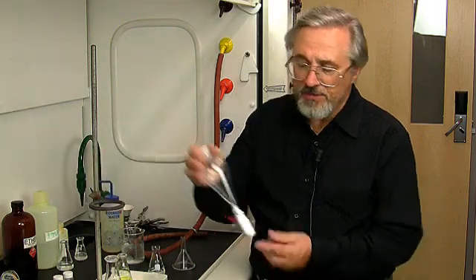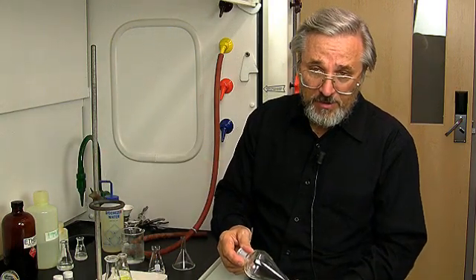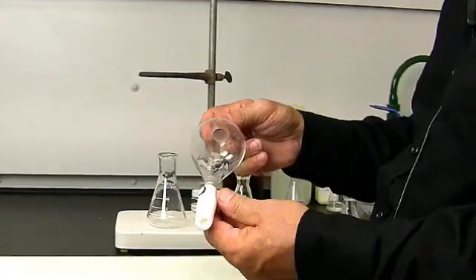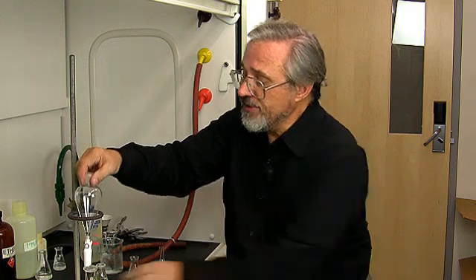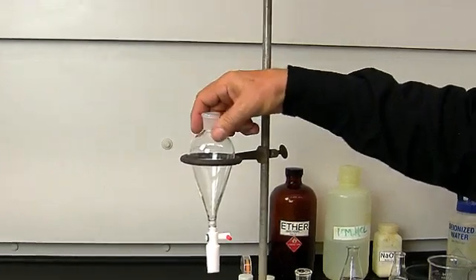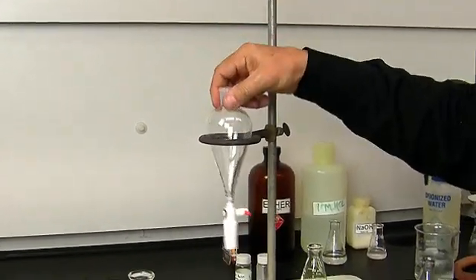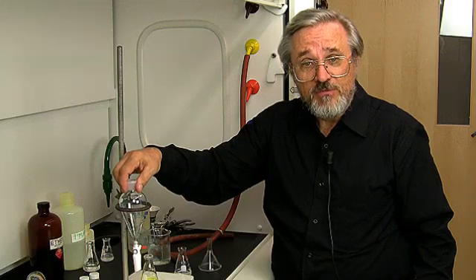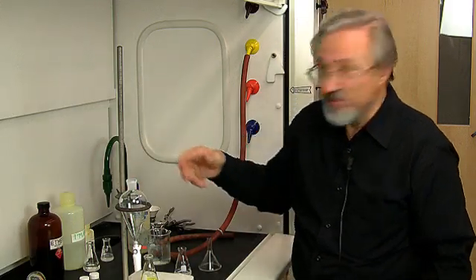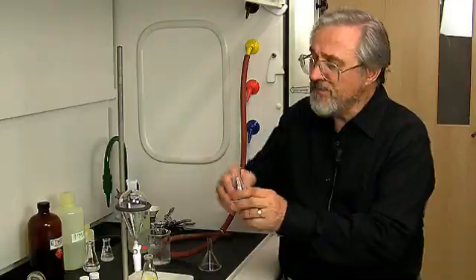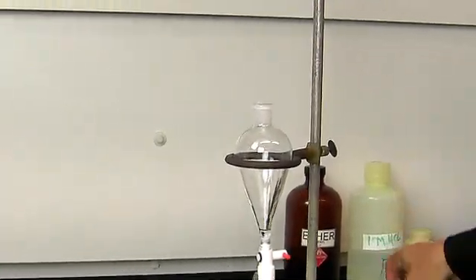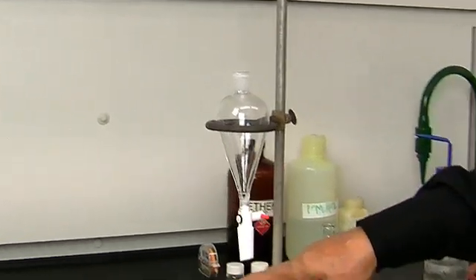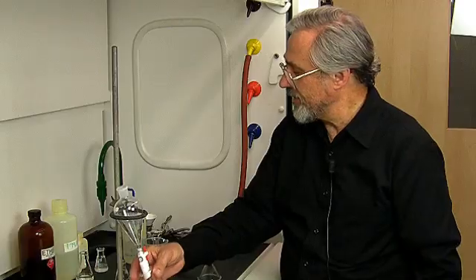We're going to be using a separatory funnel. The first thing you should do before you do any extraction in a separatory funnel is to test to make sure it doesn't leak. Here's our ring, and we've also chosen a ring that's small enough to hold this, but not to have the funnel fall through. That, of course, would be tragic. We're going to take some more diethyl ether, and we're going to put it in here just a little bit, and we can see that there's no dribbling of diethyl ether down through the tip of the funnel.